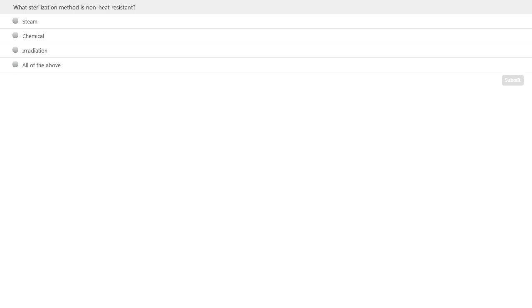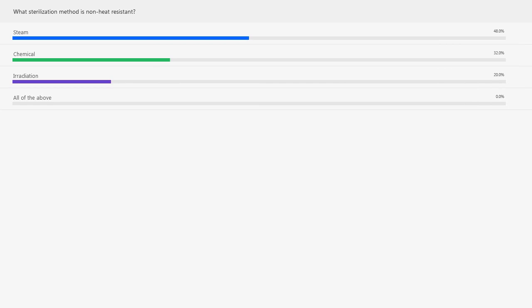Okay, let's take a look at the results here. It looks like there's no one clear winner, Jeff. Steam seems to be the winner. And Michael, it is steam sterilization, and for the audience, I kind of tricked you with the wording of that. It's a little tricky, but steam sterilization is non-heat resistant, meaning that if you have a primary packaging component that is non-heat resistant, then you don't want to utilize steam sterilization due to the fact that steam sterilization is roughly 121 degrees Celsius. And again, it'll degrade the primary packaging component. But I have it worded to try to throw a little bit of a curveball to the audience.